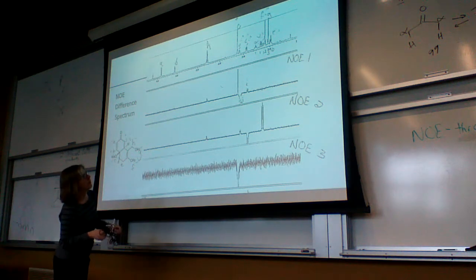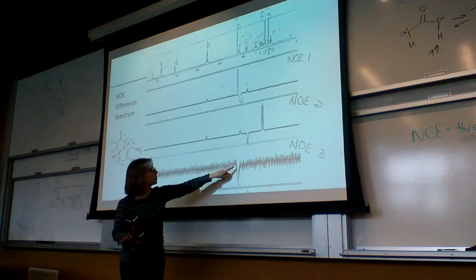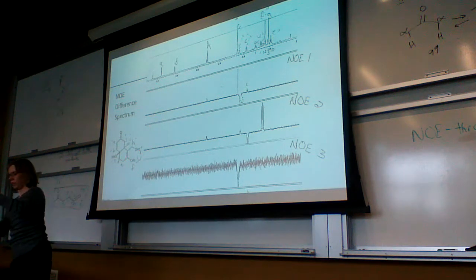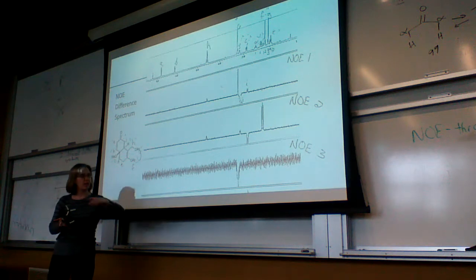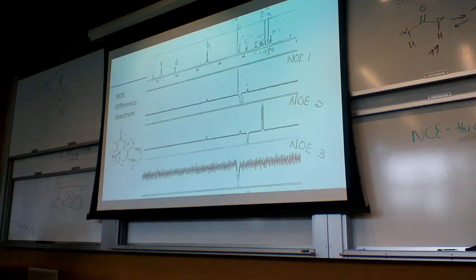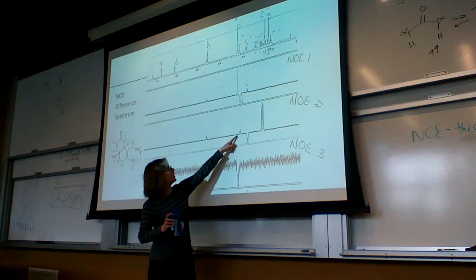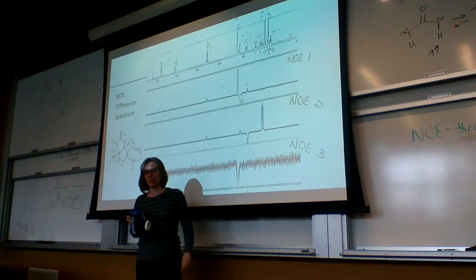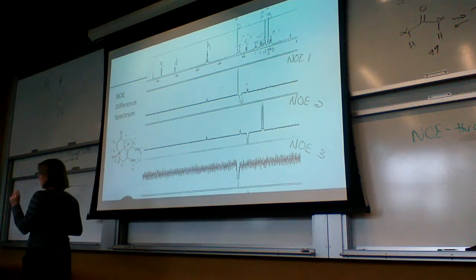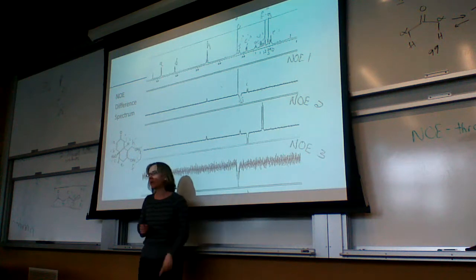The other interesting one, I believe this is the irradiation of the methoxy group, and you don't see a significant impact of that one with any of the other hydrogens there. So the irradiation of methoxy doesn't significantly impact it, but it's a rather noisy spectrum, as you see, and so there may be a little bit of this peak that might show up. It looks like it's kind of getting bombarded by whatever irradiation. So you have to be careful with this technique because you're irradiating something that's really close together, like these two peaks. Sometimes they don't show up very well.